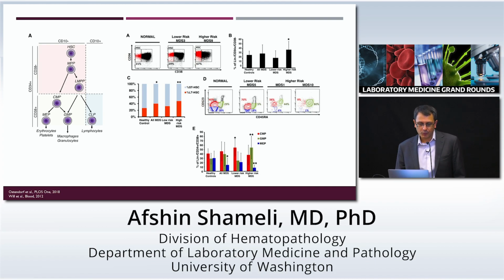In general, the CD34 positive blast population is a heterogeneous population, and that is because the CD34 positive population undergoes a series of maturation stages, starting from hematopoietic stem cells, which lack CD38, and differentiate into different progenitor cells that produce lymphoid progenitors and myeloid progenitors, such as granulocyte monocyte progenitor and megakaryocyte erythroid progenitor. This heterogeneity can be reduced or lost in the setting of myeloid neoplasms.